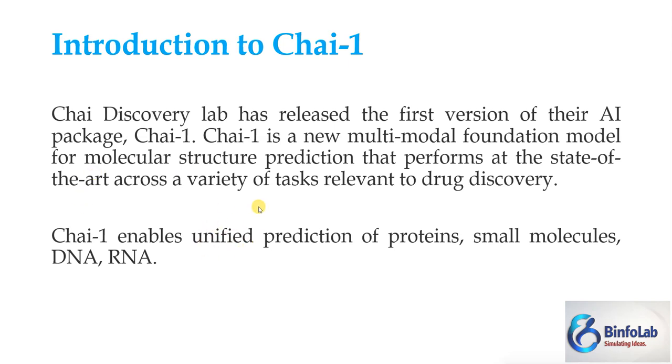I'm presenting this program to you, and in this series this is the third program I'm presenting. I have also taught you about AlphaFold 3. I have also taught you about Boltz-1, and now I'm going to teach you Chai-1, because Chai-1 claims in their results that it is producing better results than AlphaFold 3 in terms of protein and ligand pose predictions.